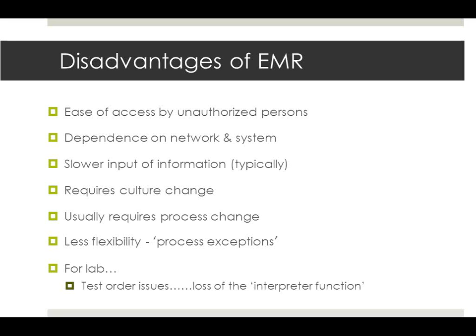Disadvantages, because they aren't perfect: unauthorized access. Used to be you'd have to come up to the ward and actually pick up a chart to be able to access that information. Now that it's electronic, it's hackable. We have to put up security safeguards and those kind of things. We'll talk more about that with HIPAA. You're dependent on that network and the system itself. The system goes down or the network goes down, you've got problems.